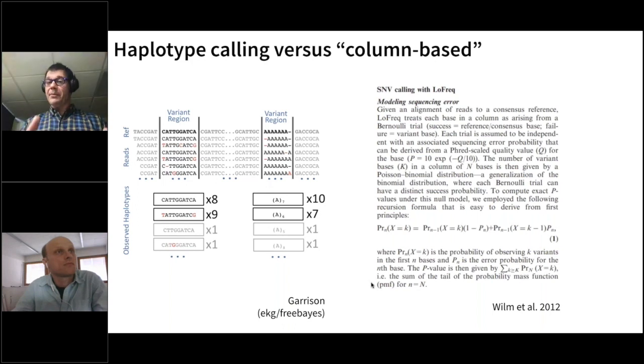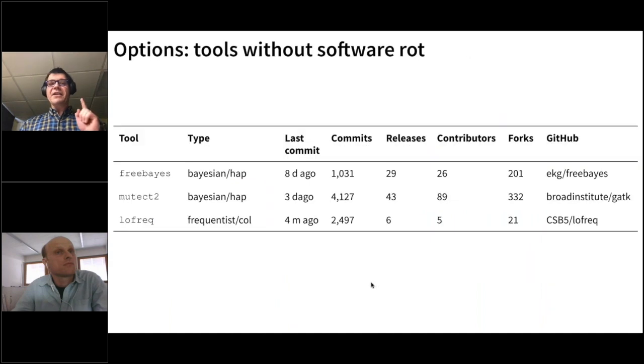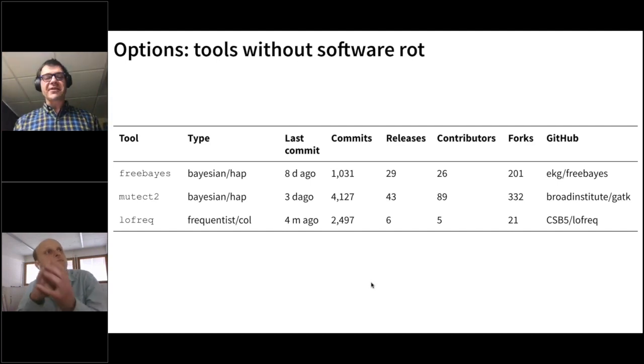Freebayes is more complex. Another reason why we're listing these two tools, Freebayes and Mutect2, is that despite the fact that they were originally developed, again, in the framework of the 1,000 Genomes for human, they have been modified to allow for calling variants in mixtures where the ploidy is not certain, when you have, for example, a lot of viral particles floating.